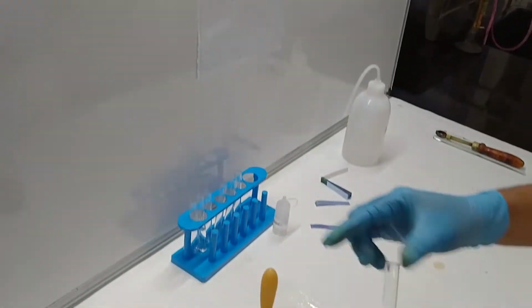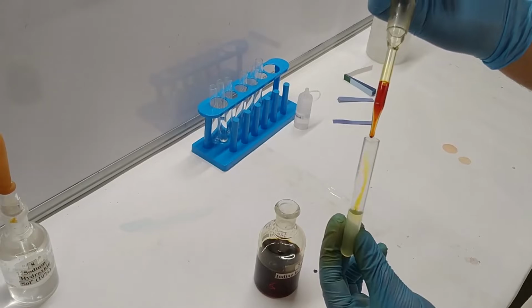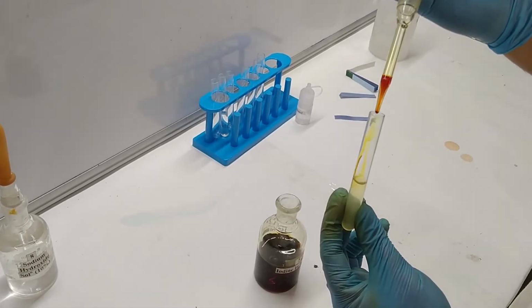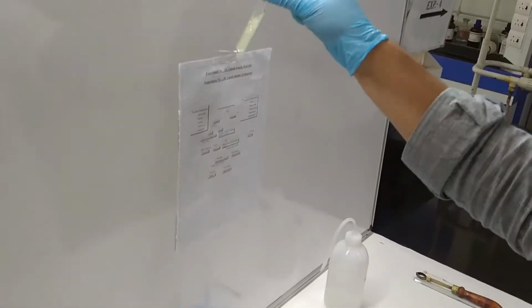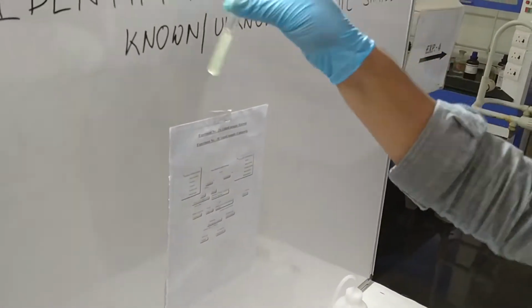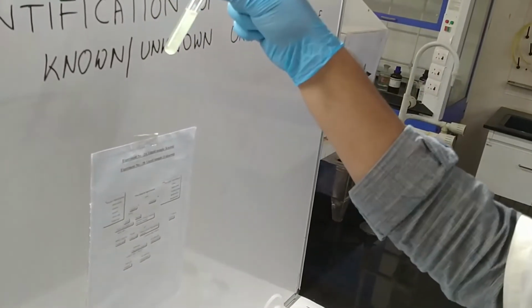Okay, and I think it consumed a little bit more iodine solution. You can see it has changed into faint yellow color, something is present inside.